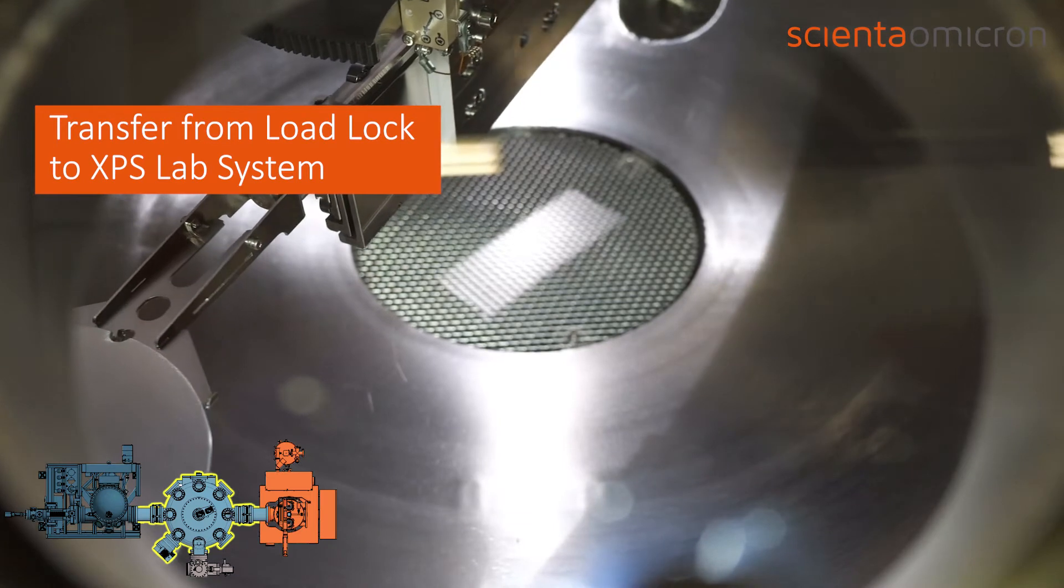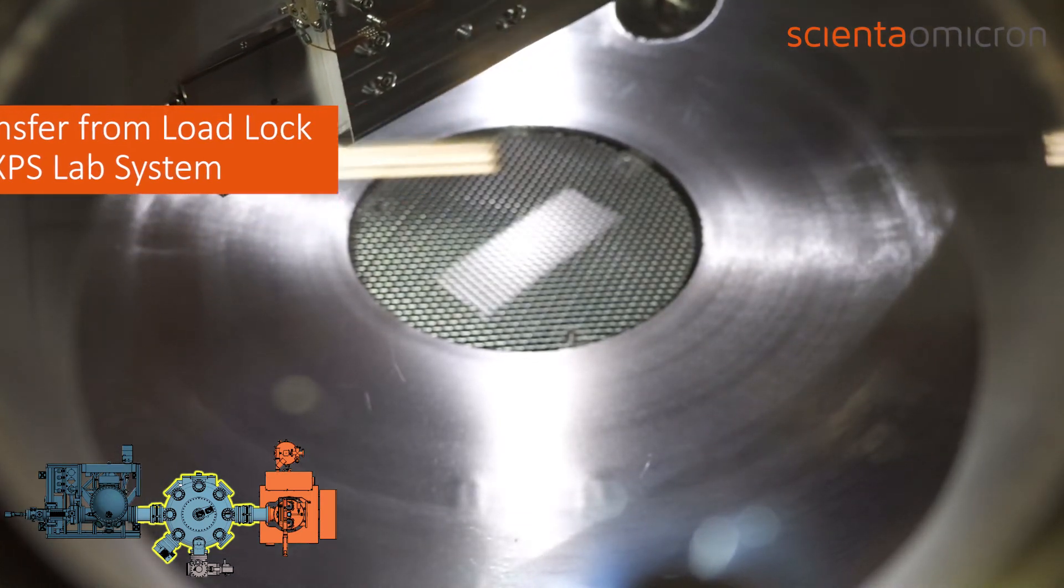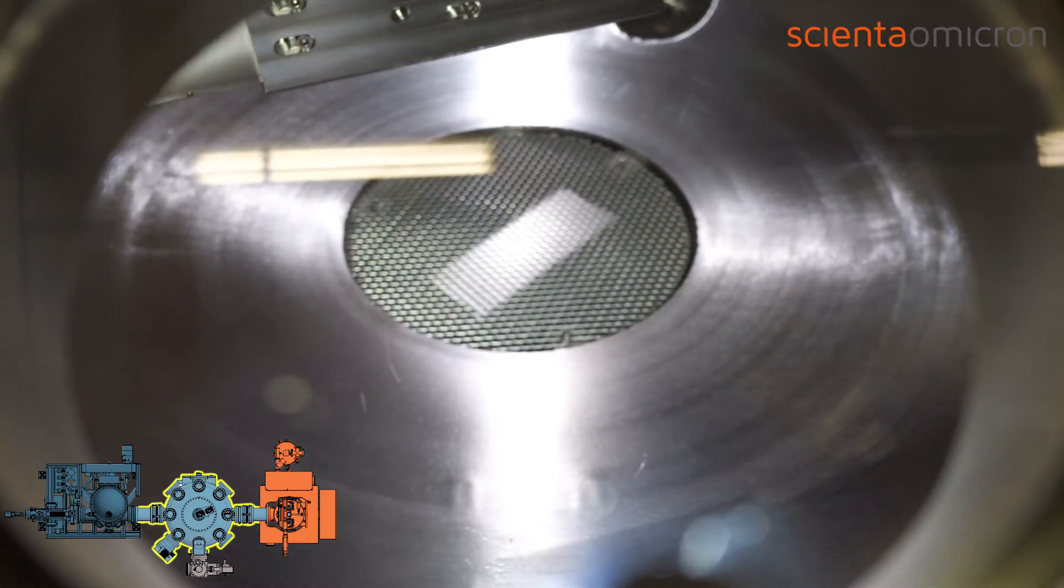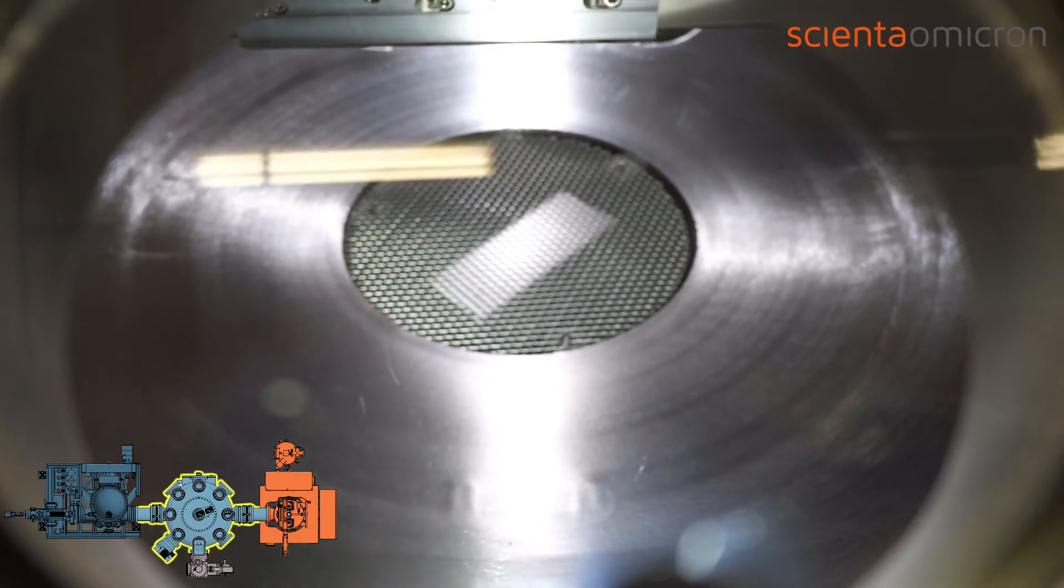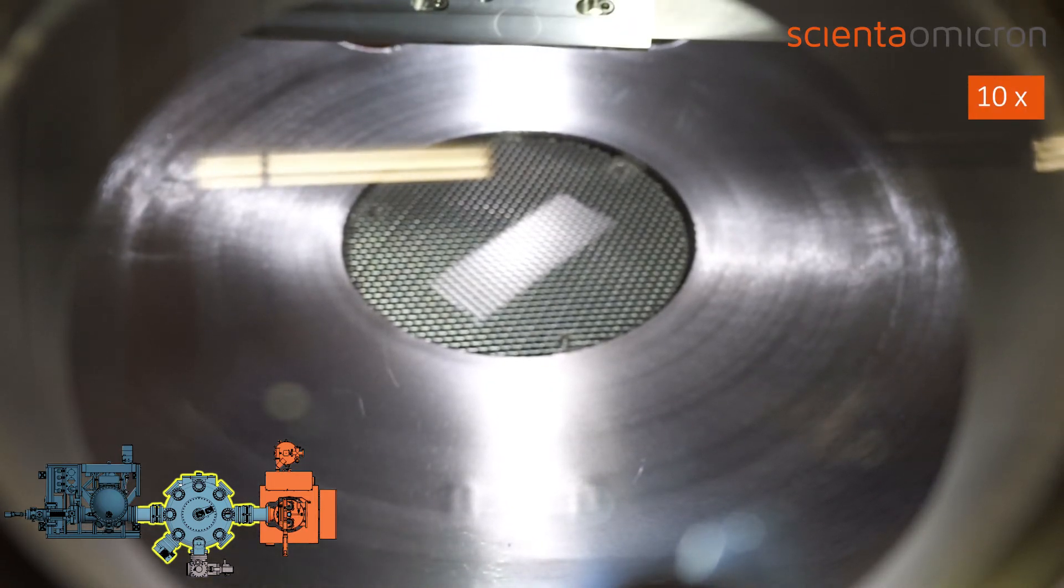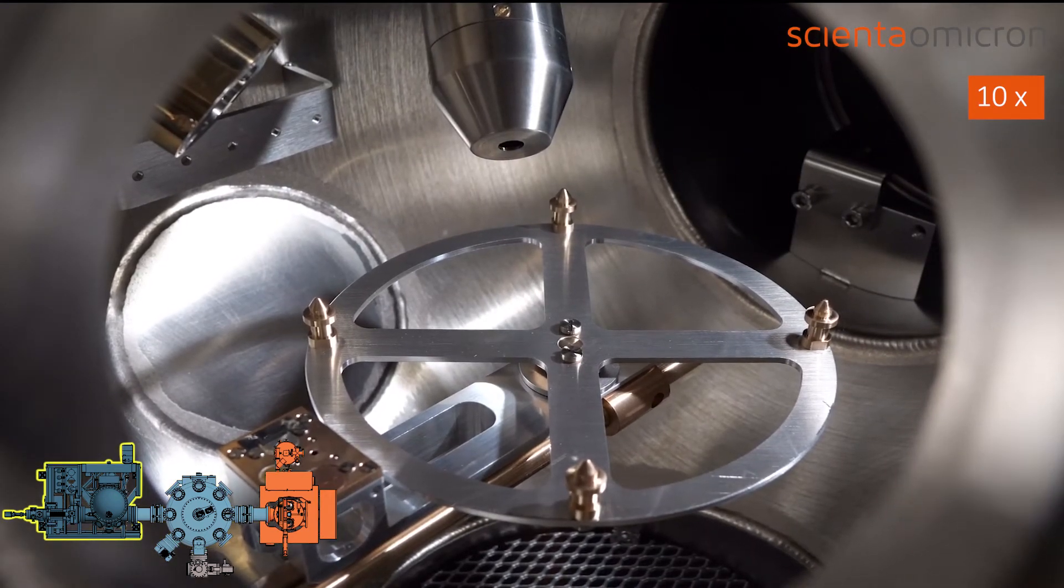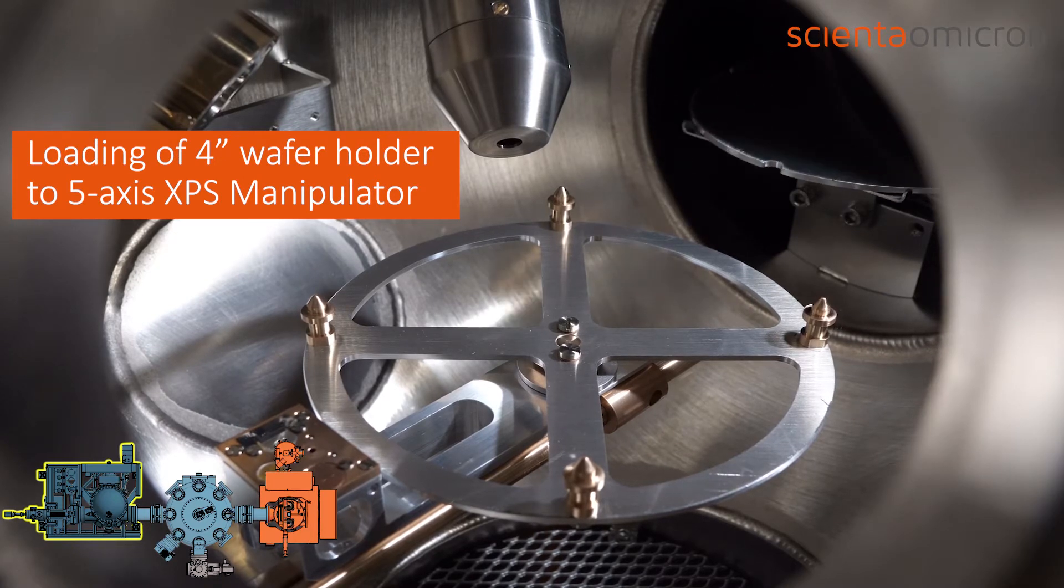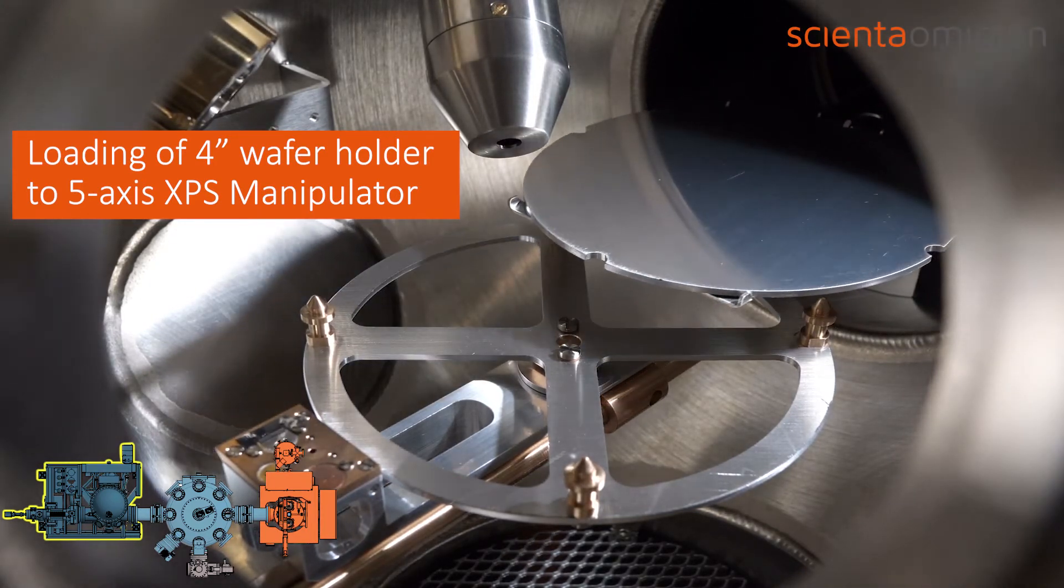The next transfer process will demonstrate how the wafer holder is loaded onto the XPS lab manipulator. After initializing the sample loading process, the robotic arm rotates towards the connection flange of the XPS lab system. When both the XPS manipulator and the robotic arm are in position, the UHV gate valve opens and subsequently the arm extends into the XPS lab chamber. The arm stops at a standby position, waiting for the user to verify that the transfer shall proceed.